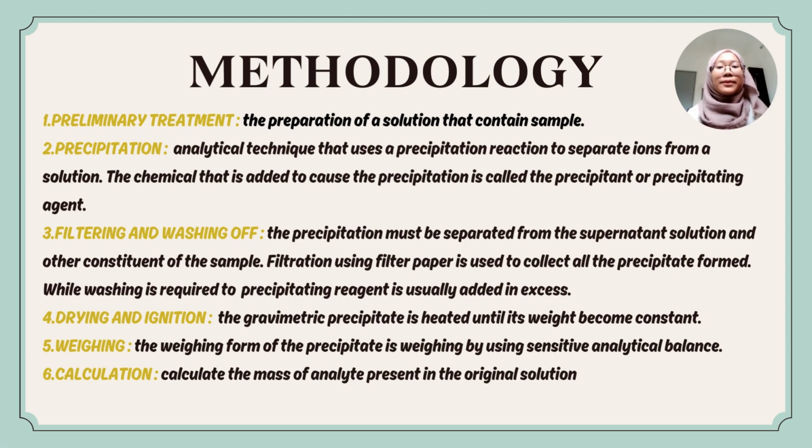Then is weighing. The precipitate is weighed by using a sensitive analytical balance. And for the last one is calculation. Calculation is to calculate the mass of analyte present in the original solution.